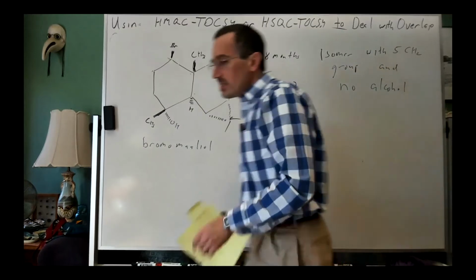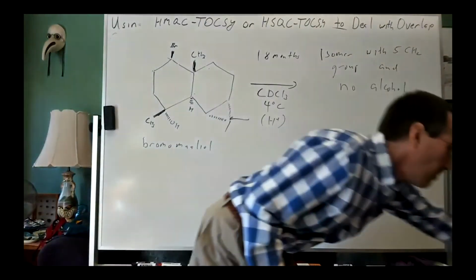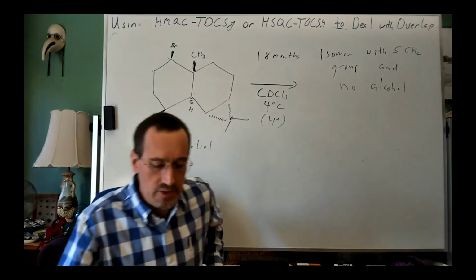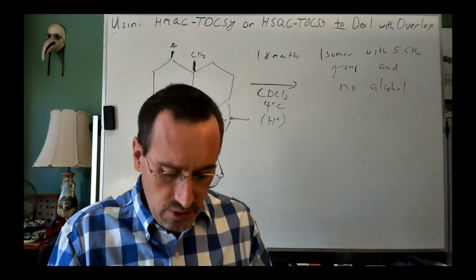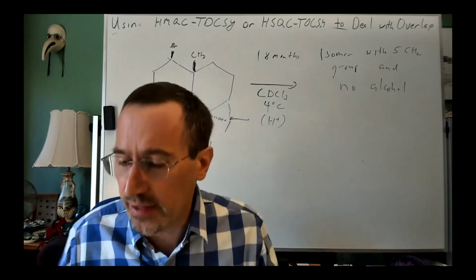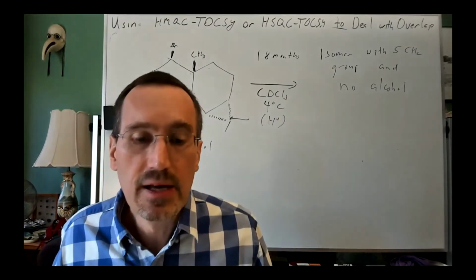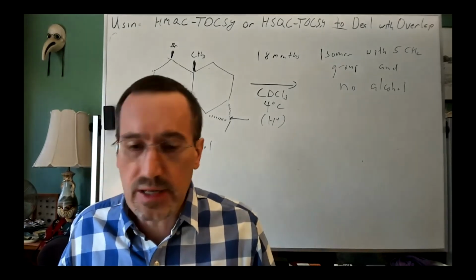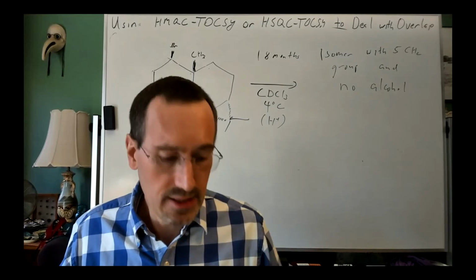And so the researchers ended up wondering what they had. And the problem we're going to see is that the spectra overlap severely. So I want us to take a look, and we'll start with the spectrum of this. Hopefully I can do this time with the handout without things going kablooey in Zoom. So I'm going to share the screen and we're going to start with our first page of the handout.